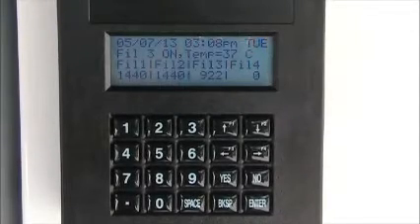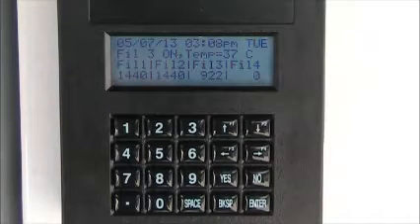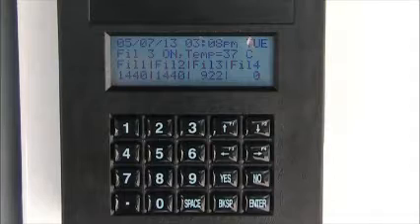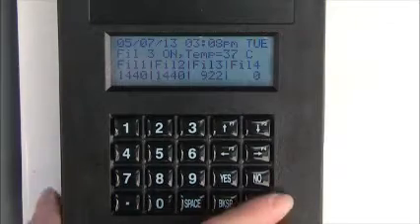The week 3 sample change is unusual in that the pumps will be on when you arrive at the site. This is because position 3 of each cartridge is currently running. The controller display will show you that the filters in position 3 are running and will provide you with the final ETs for positions 1 and 2 and the elapsed time up to this point for position 3. Press Enter to get to the main menu and then press F1.